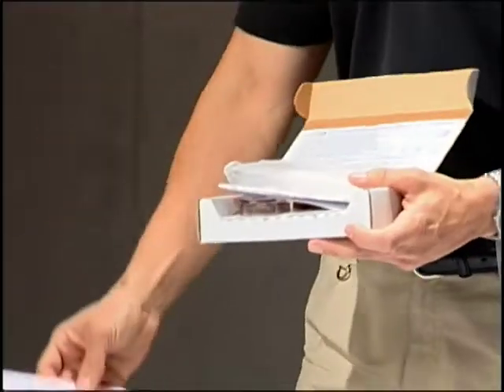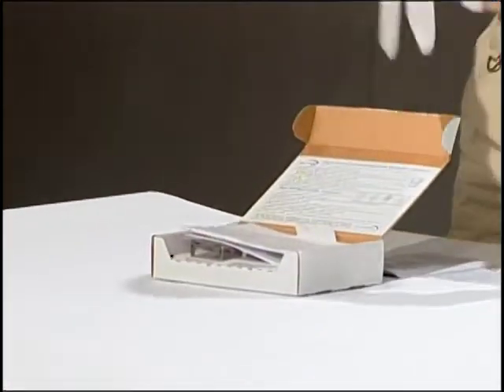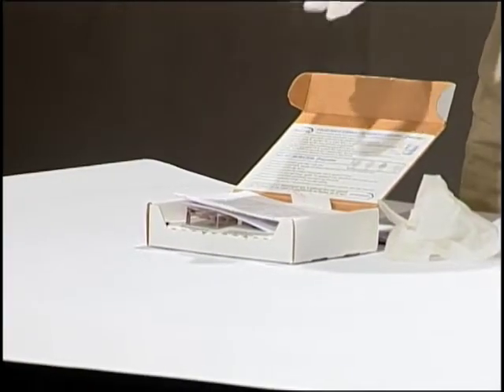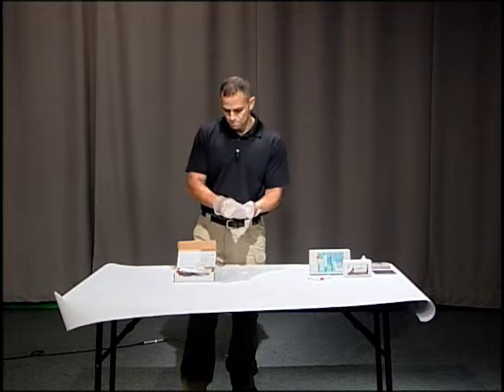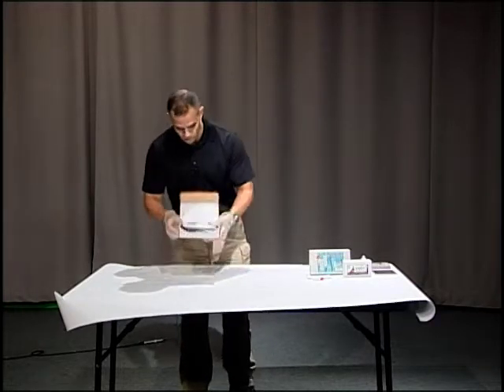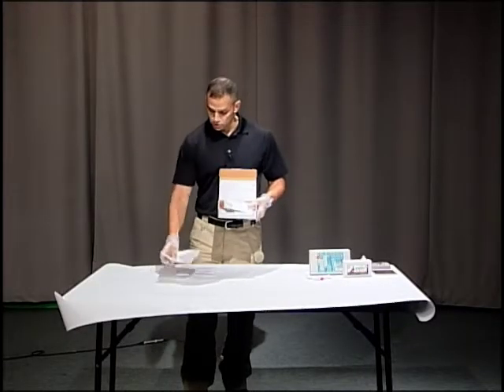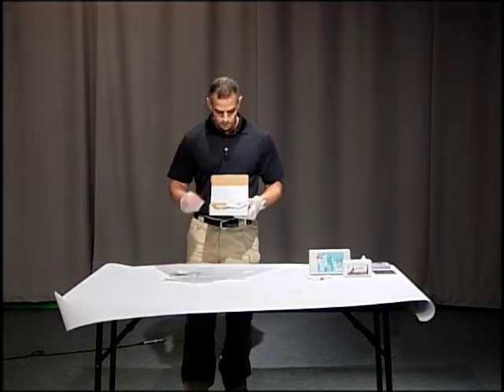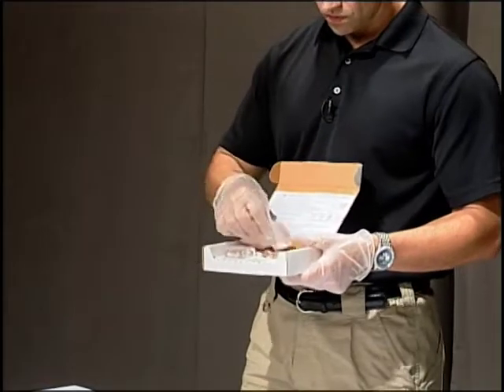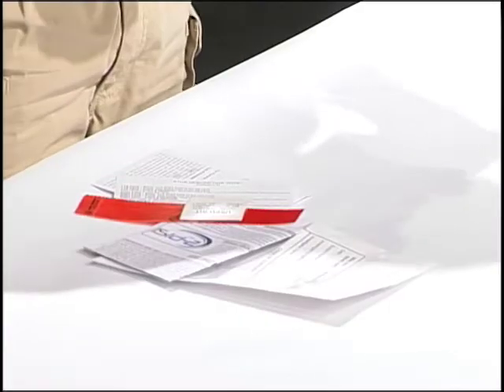Everything that you need is going to be in the kit, including your gloves. You're going to have a collection envelope to put your evidence in once you obtain it, your directions, your seals for your evidence, and here is your collection kit.